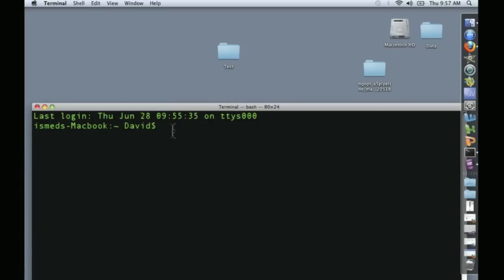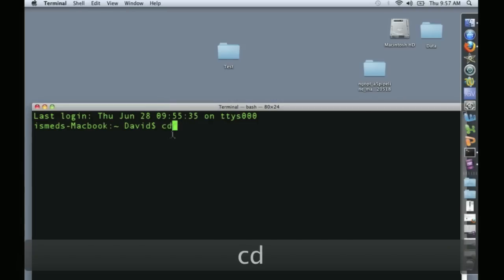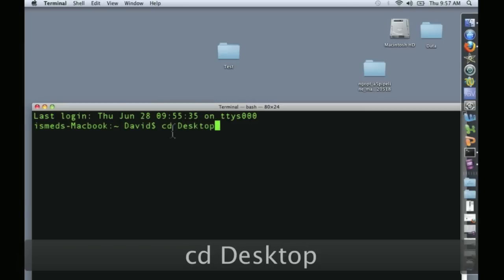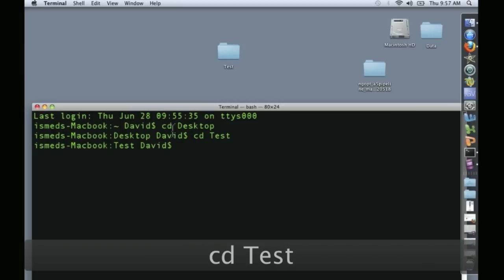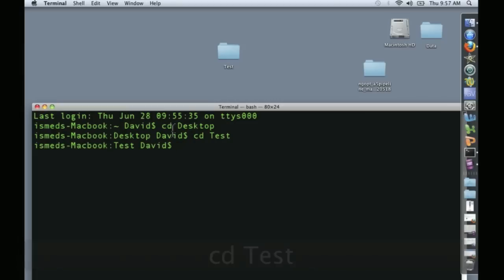To move in Unix you type cd and I want to go to my desktop. Now I'm on my desktop and cd test and now I'm inside the test folder. Now when I run the pipeline this is where the output files will appear.